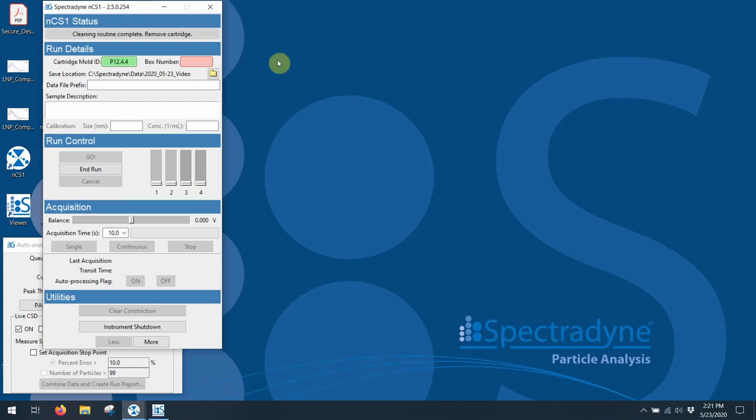The next thing I do is I put in the cartridge box number, which is actually a date, in this case, 2002-21, which means that this particular cartridge was cast on February 21st of 2020. The reason for putting in the box number is to make sure you use the calibration for the date closest to when the cartridge was actually cast.